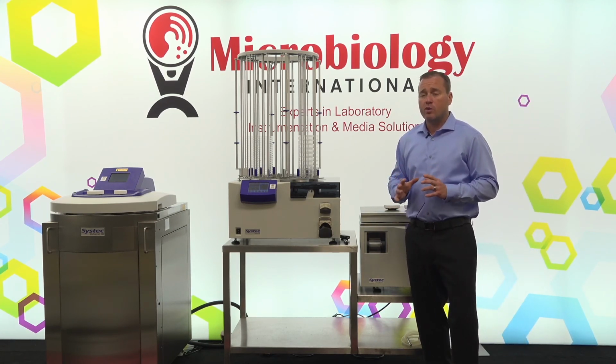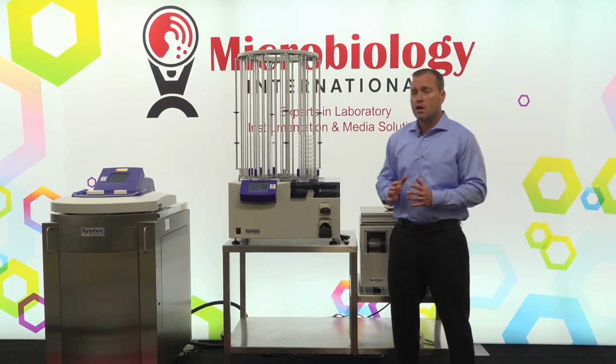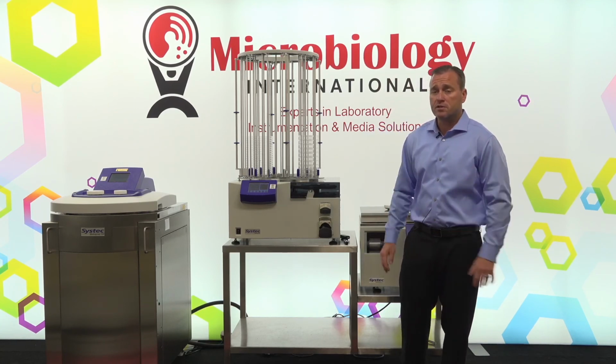Now, the IQ/OQ is a standard application, and so that document already exists. For your performance qualification, it would depend upon your application, and those documents would be written by us and provided to you for review before we would come out and do those services.